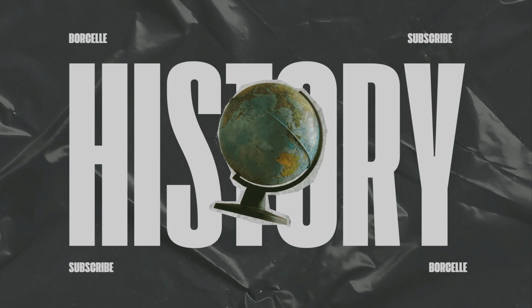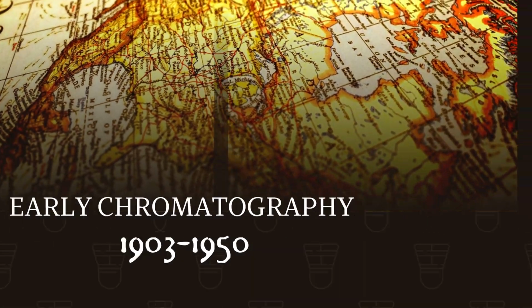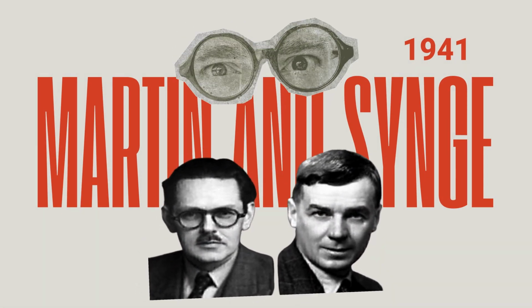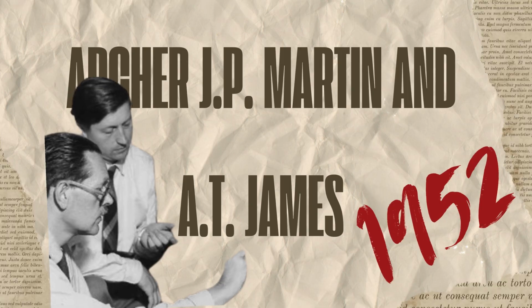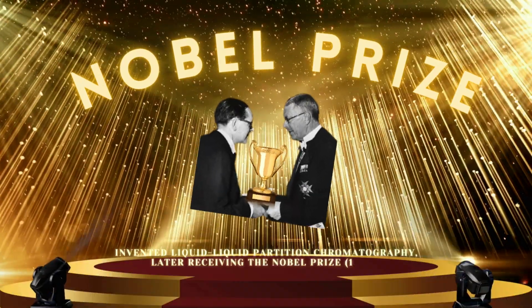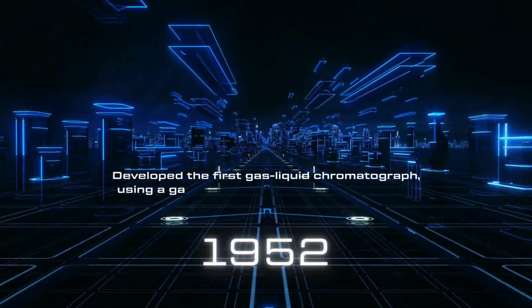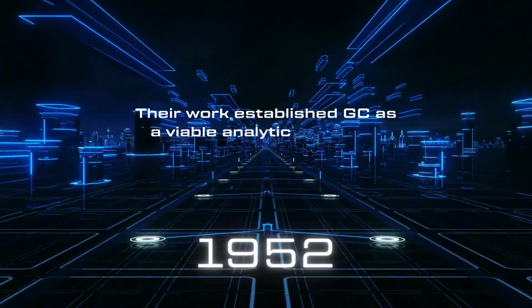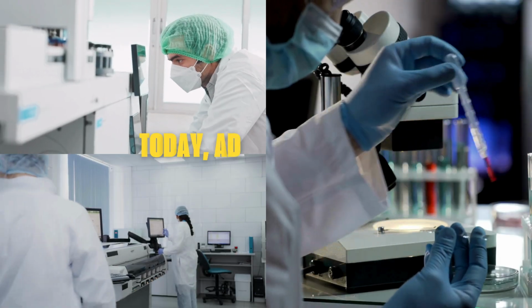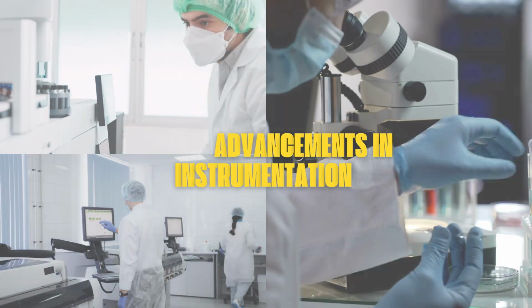The origins of gas chromatography trace back to the mid-20th century. Scientists Archer John Porter Martin and Richard Laurence Millington Synge revolutionized chemical separation techniques, earning the Nobel Prize in Chemistry in 1952. Their pioneering work laid the foundation for modern chromatography. Soon, the principles they developed were adapted to gas chromatography, enabling the analysis of volatile compounds with unparalleled precision.